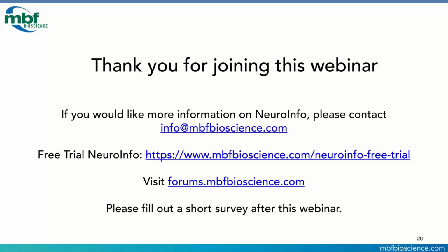And the reason that works is like Chip showed, we're doing things on a section by section basis rather than the entire volume at once. And so you don't really need a huge computer to be able to do that. But again, the minimum specs are on the website.